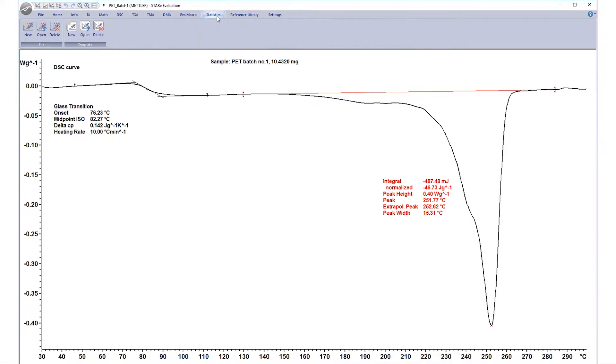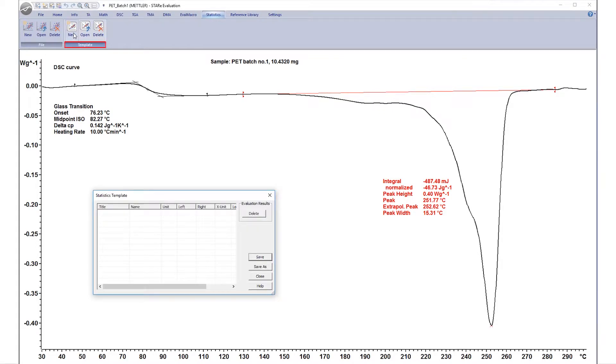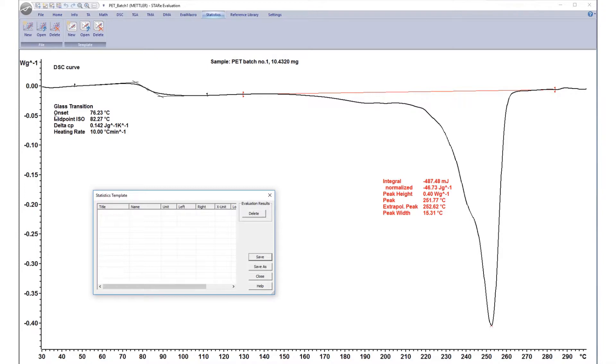Select the Statistics tab, followed by New under Template. The Statistics Template dialog box appears. To include results in the template, simply select the result of interest. Selections are shown in magenta.